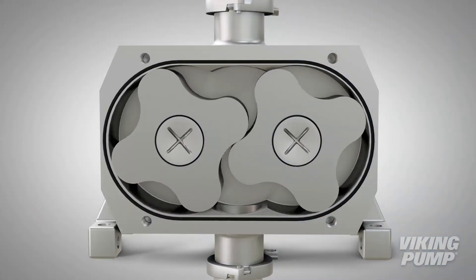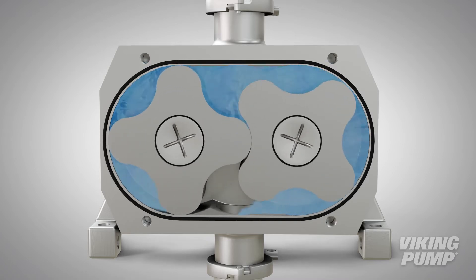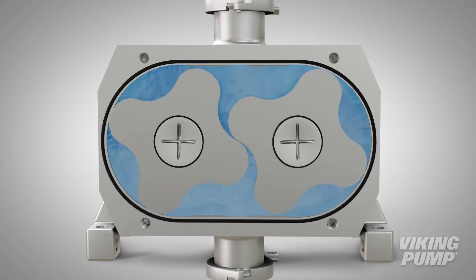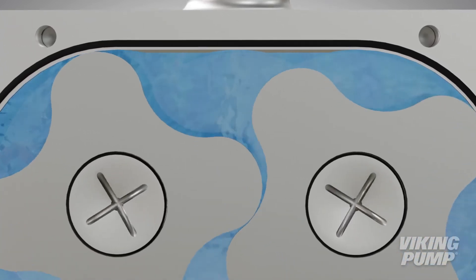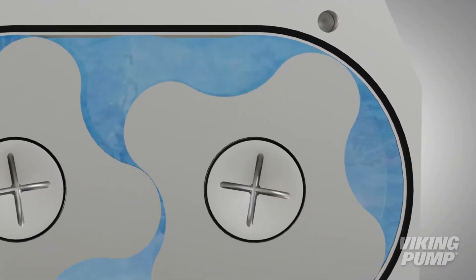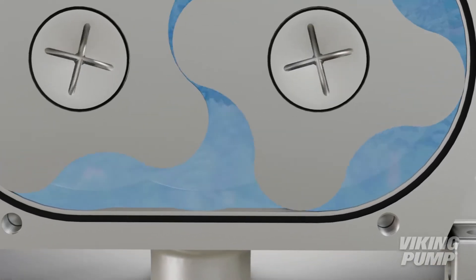The Sterilob Series stands apart from competing pump technologies with its unique multi-lobe rotors. These four-lobe rotors allow for gentle, low-pulsating handling of sensitive media by carrying liquid from the suction port to the discharge port between cavities created between the lobes of each rotor and the casing wall, resulting in low stress and low shear to the liquid.